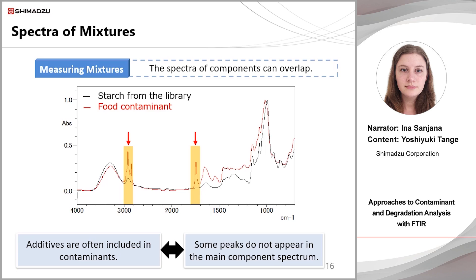Now we look at the case of mixed contaminants. In real-life analysis, there will normally be more than one component. The slide shows an example of searching the standard library for food contaminants in a sample. The sample spectrum, shown in red, almost matches the spectrum for starch. However, due to the presence of lipids and other substances, it differs from the search result — the split peak near 2900 is large and there is a sharp peak at 1720. Because the spectrum includes additives as well as the main component, it is important to obtain a large amount of spectral data for more accurate qualitative analysis.